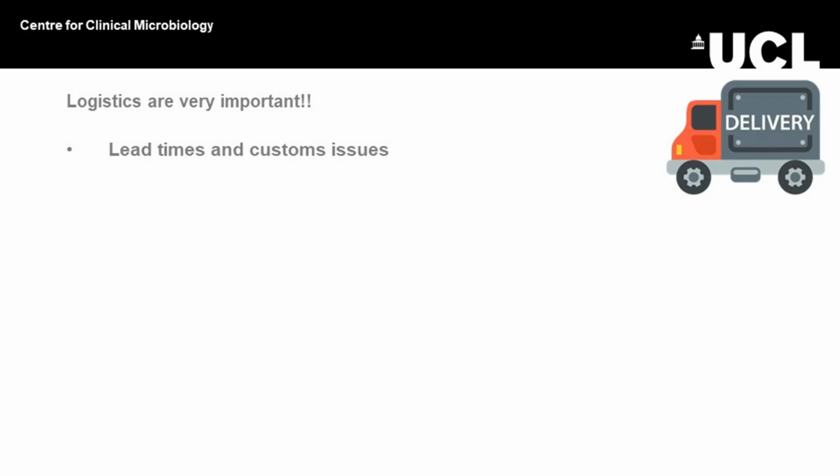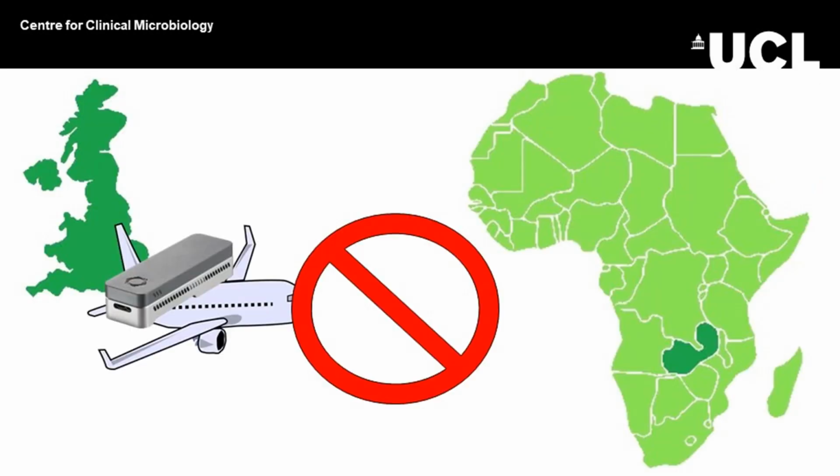So high accuracy would be good, but if you don't have a computer that's capable of that, then fast base calling with the newest version of Guppy, which is the base calling program, is going to work okay. We also then analysed different programs that you can use. So there are some command line ones and some cloud-based ones, and we found that TB Profiler seemed to work quite well.